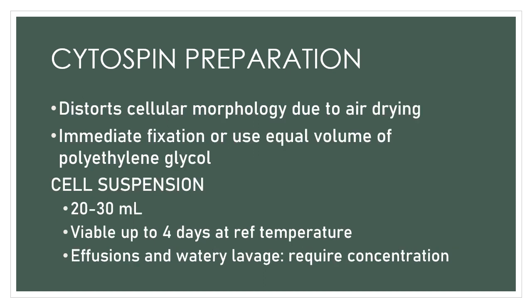Your cytospin preparation distorts cellular morphology due to air drying. And so, immediate fixation or use of equal volume of polyethylene glycol for this one. Okay, and so that's still for your cytospin preparation.